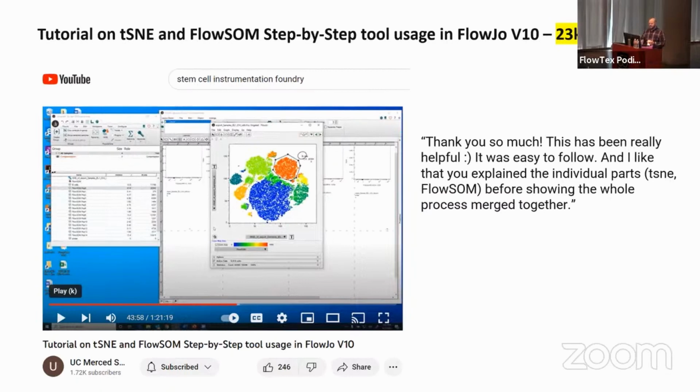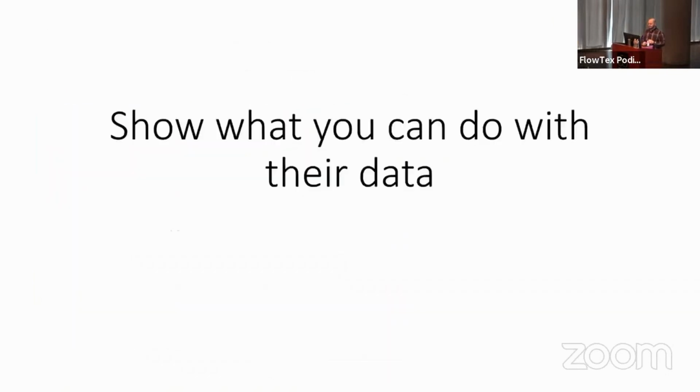And so another video I made during COVID was how to use tSNE and FlowSOM together to do the process and get the data. Again, people commented on the step-by-step instructions, which was really what I was going for. And then, as I was mentioning, the next level I think that core should aspire to is, can we support them with their own data directly?